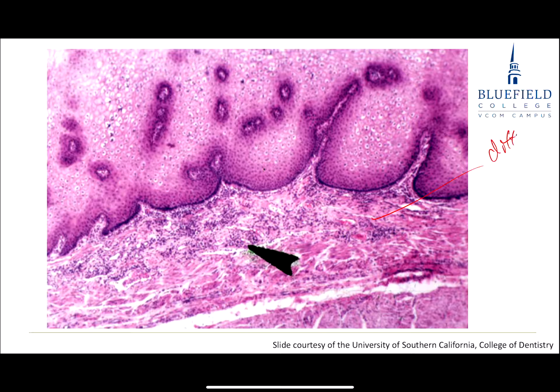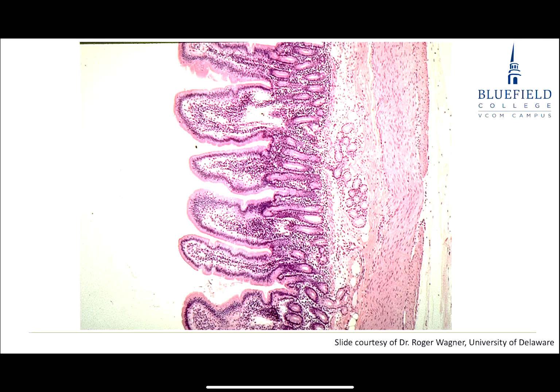All right, and this is just the one I put up before. They have it on its side on the website, so I left it on the side. Just a lot more dots in here. I wish they had taken a little bit lower power magnification so you could see left or right, or should say top or bottom, where there weren't as many of the dots, not as many nuclei, so you could definitely see we're talking diffuse lymphatic tissue.